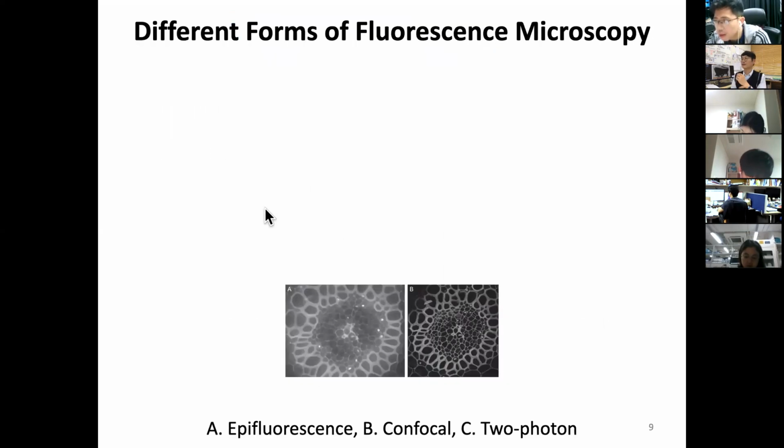All right. So now I want to discuss a very difficult subject, but in great laboratories and in good places, we will have a more sophisticated microscope. And this is a chance for you to understand what different kinds of fluorescence microscope there are. I have to say we have a confocal microscope and we have a two-photon microscope in our institution, okay? So this is a great example.